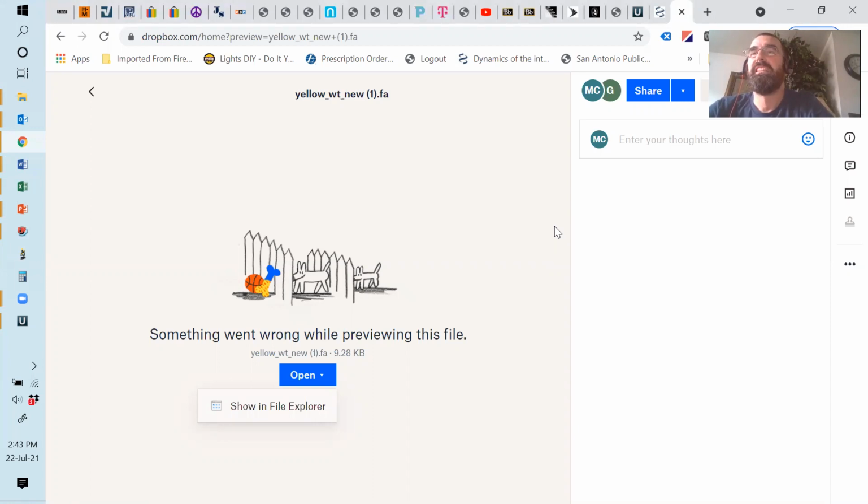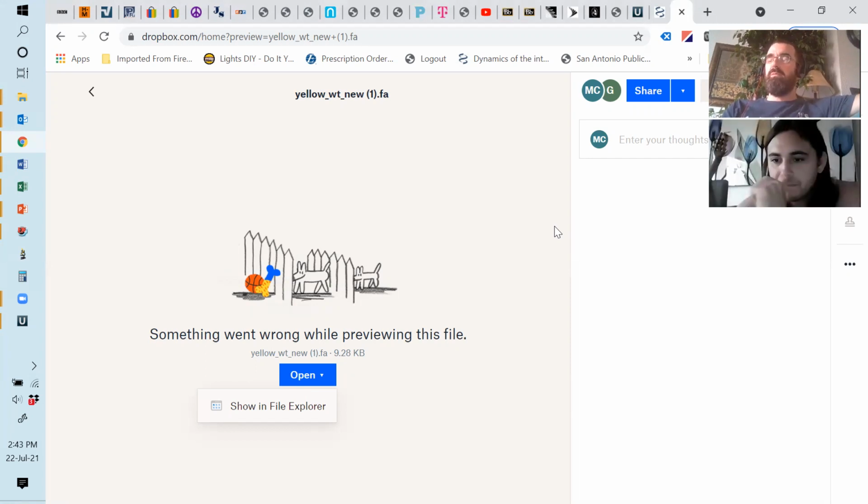So do we just need this program to help us answer these questions, or are we doing something else with it? No, we're actually going to work through the analysis. You do need it to help answer the questions because the questions are tied to you doing specific things with the program. And the problem we're having with Adam is that for some reason he can't get the wild type or the genomic sequence. His computer's not letting him download it from any source.